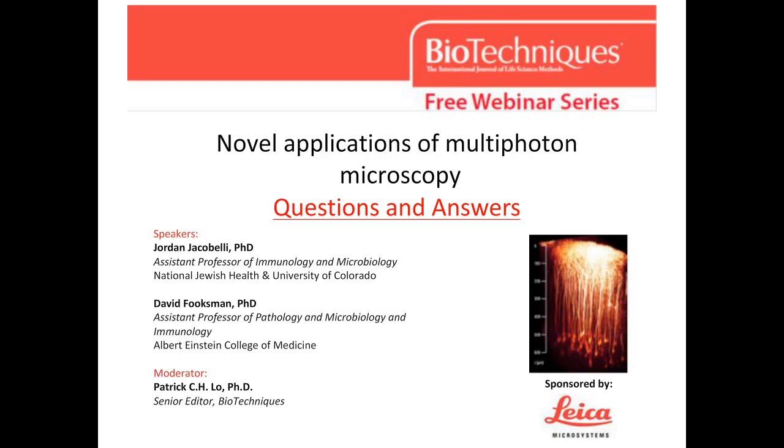But usually the technical limitations of the microscope are never reached, and it's more the practical aspects of trying to visualize because of the prep or whatever that are usually the limiting factors. Great. Yeah, I would say, as you just said, probably a millimeter is your best-case scenario, and that's more for neuronal types of tissues, which don't scatter as much. But for immunology, lymph nodes and particularly the spleen scatter much more. So you're probably more limited to between 300 and 500 microns, would be my guess.